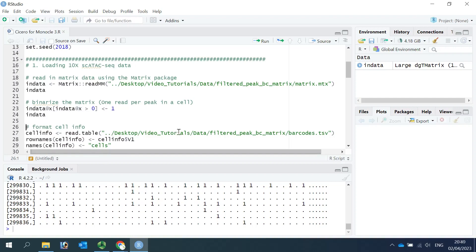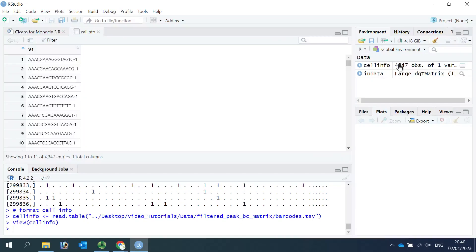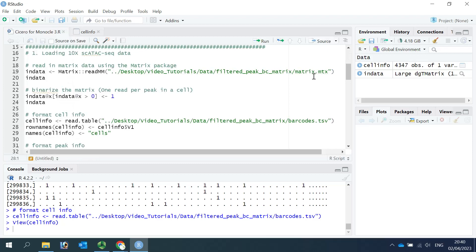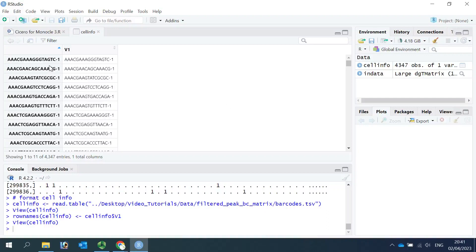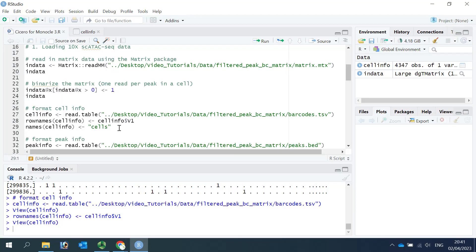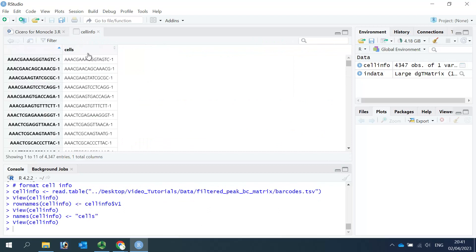Next, we can read the barcode and cell information. We can inspect the cell information to see the barcode. The rows are named by numbers, and the cell barcodes are in the column named V1. We need to make some changes for the barcode — first, we change the row names to the barcode names from the V1 column. Now the row names are the barcodes. We also rename the first column from V1 to 'cells'.